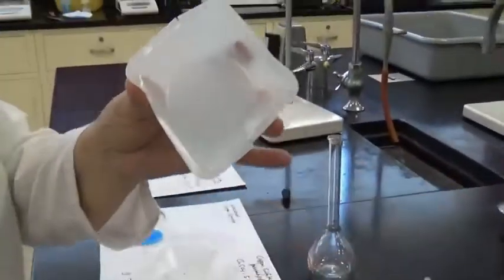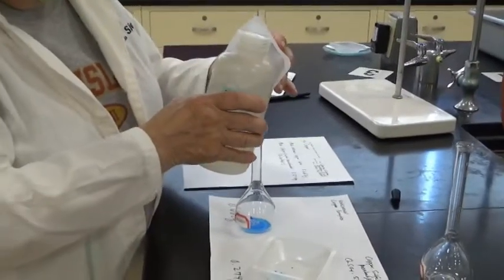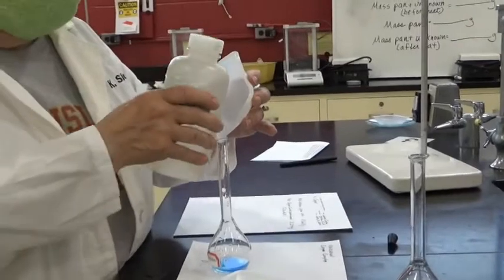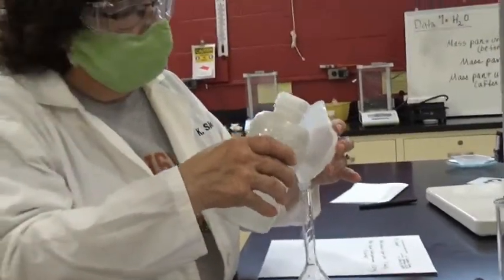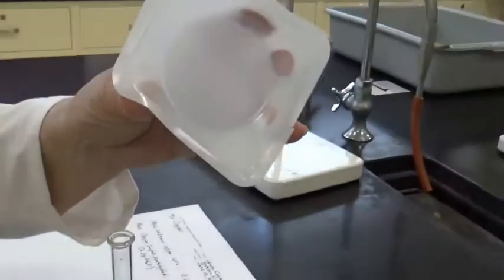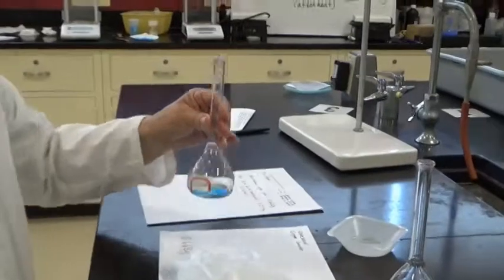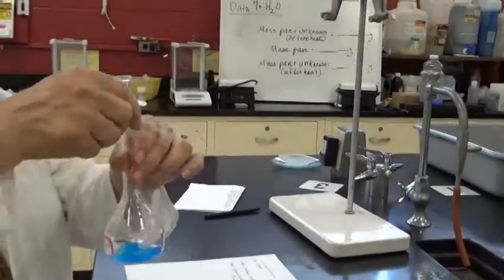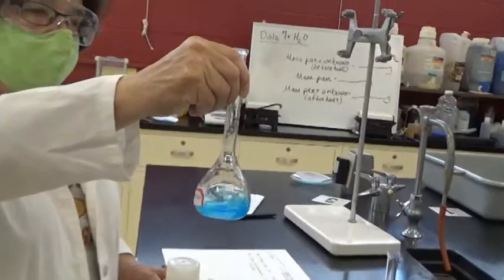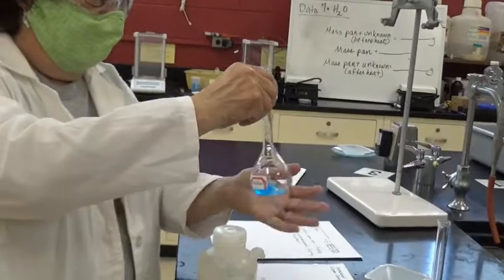So as usual, I use a little water. This is called a quantitative transfer. Okay, and so what I'm doing is I have to put water here anyhow, so I'm going to try to rinse all the blue out. And you'll notice I did a pretty good job. Am I perfect? No, but now I've got my material, my crystals here. I'm going to swirl them around a little bit.